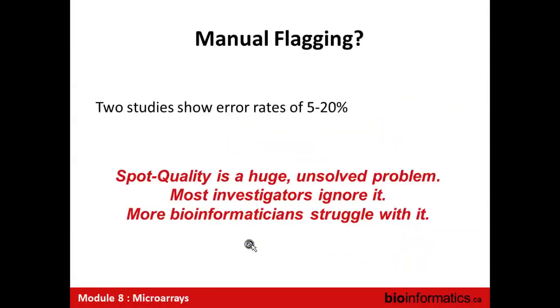When you say many bioinformaticians have spent a lot of time looking at this problem, is there a whole literature on it? Oh, yes. If you take a look at any strong bioinformatician in the microarray analysis field, they'll have a series of papers on spot quality assessment. For example, it was called MUSIC, the name of the group, a UK consortium that got non-trivial amounts of funding to try to resolve this, and Wolfgang Huber's group, who produced one of the standard algorithms used for microarray analysis, still published a couple of papers.